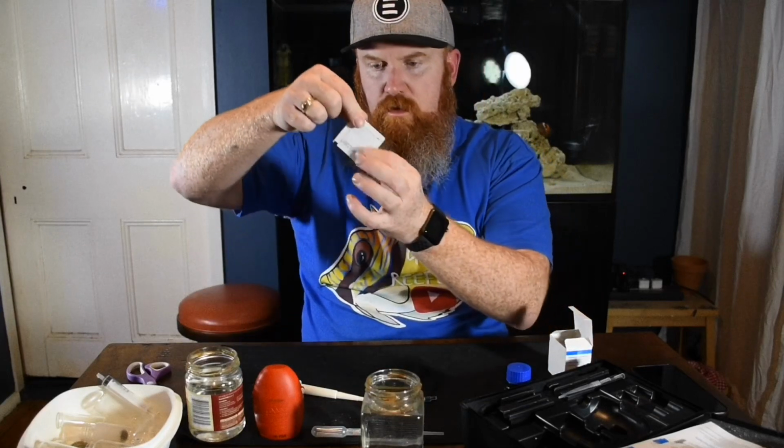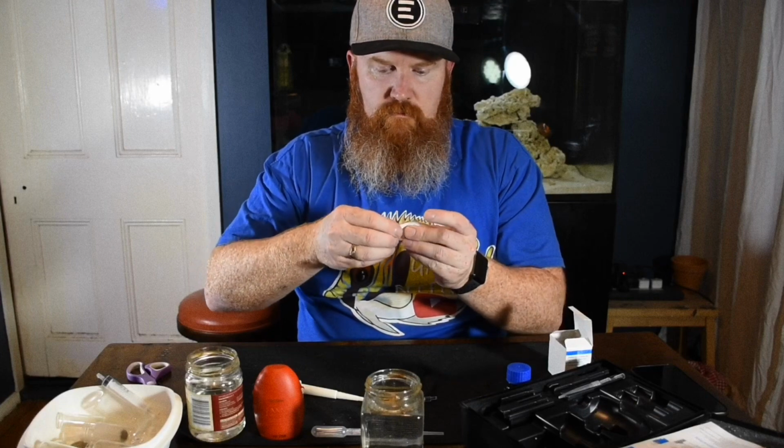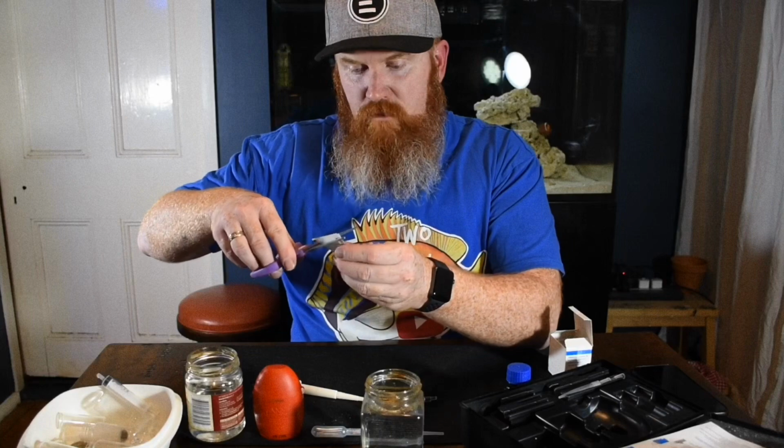Next thing you want to do is have your reagent B ready. So once again, get all the powder into the bottom corner of it here. Fold it over. Thank you, Inappropriate Reefer, for showing me how to do this. It made life so much easier.